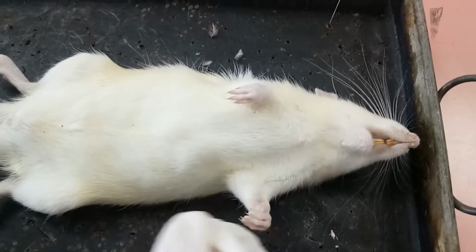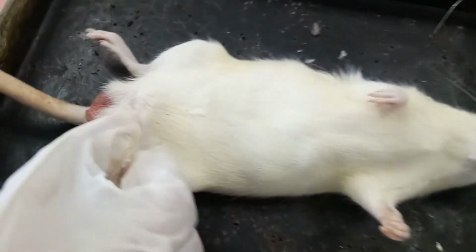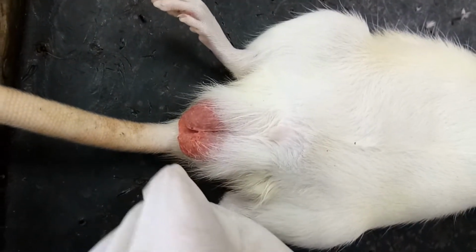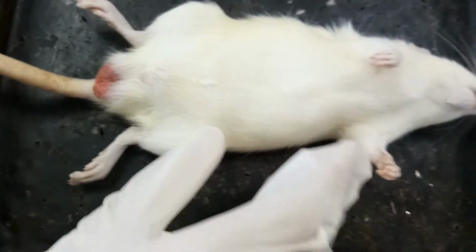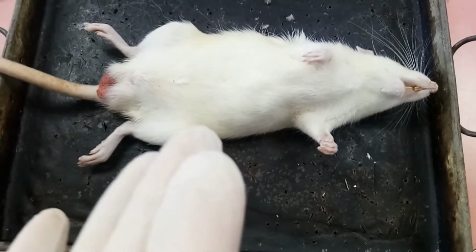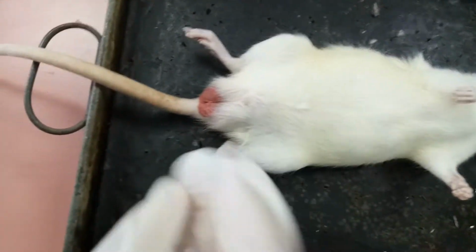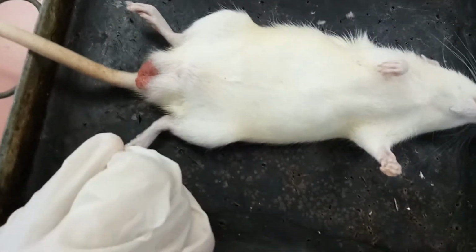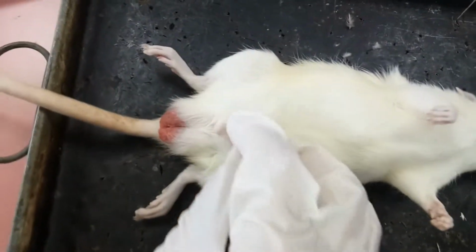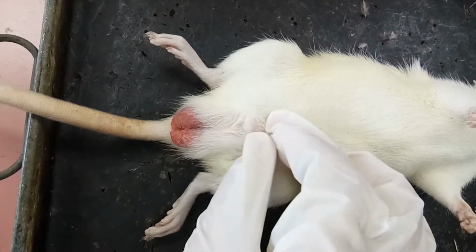The neck region. For the trunk region, we can see the anus. The anus lies at the base of the tail, and you can also see the scrotal sac. From our observation, this is a male rat because it has scrotal sacs. The penis is present anterior to the testis, and is enclosed in a loose sheath, which is the prepuce.